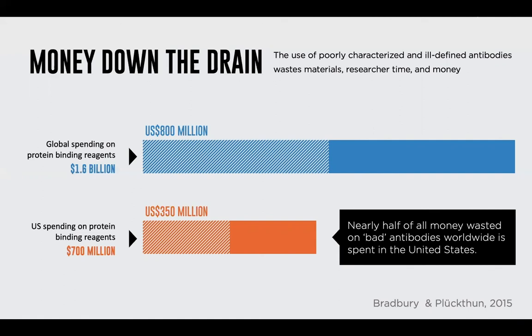We're investing a significant amount of resources into antibodies that are bad, which are producing results that are non-reproducible. And it's a really difficult thing for researchers to have to deal with because, through no fault of their own, they're just putting blind faith into the antibodies that commercial vendors are supplying. And there are some very big, significant problems here.